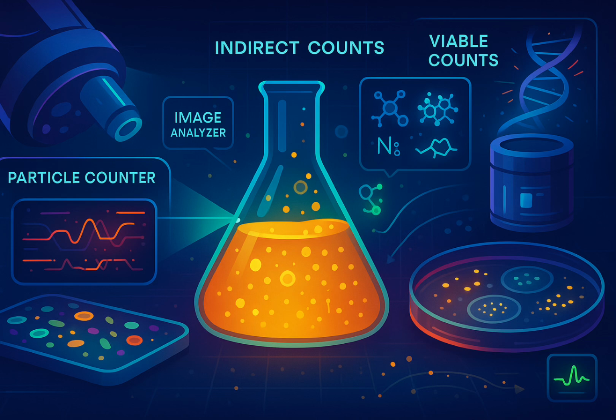You count the colonies. So you concentrate the cells first. Precisely. Makes it great for low numbers. Accurate, relatively simple, uses less glassware than MPN. You can use selective media on the plate too. Downsides: takes time for incubation, 24 hours plus. And the filter holder needs careful sterilization between samples, which slows things down if you have many different samples.